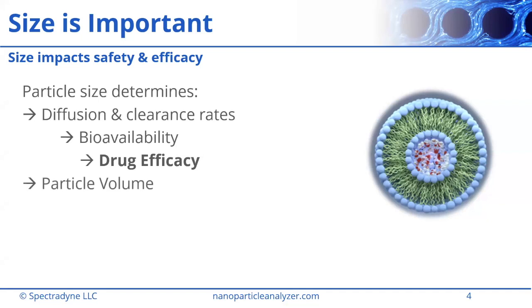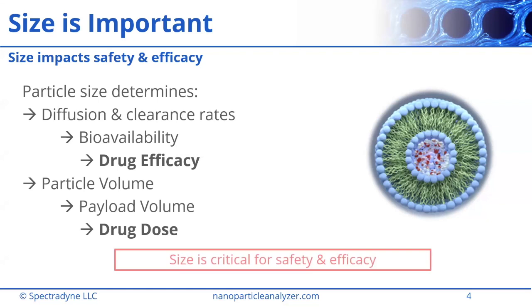Size also determines the volume of each particle. And that in turn really defines the volume of active ingredient or payload that can be carried in each particle. So it's kind of like a single particle dose. Knowing the size tells you that. Ultimately, the size of the particles in the sample is critical for the safety and the efficacy of the product.